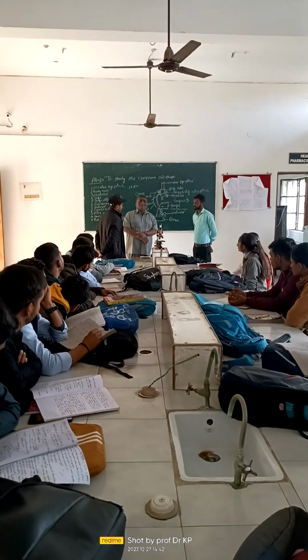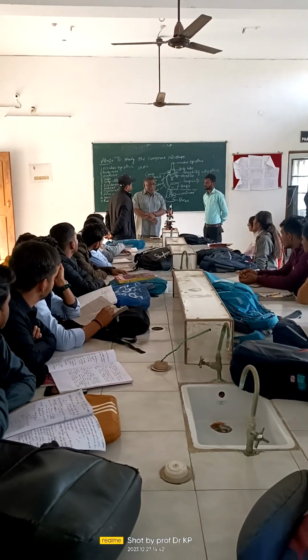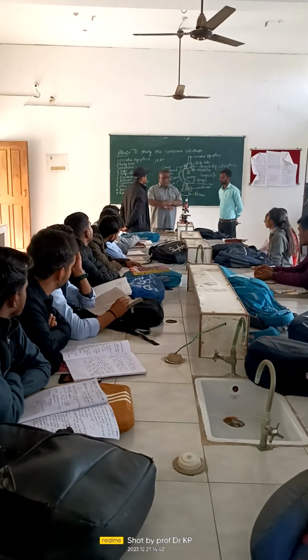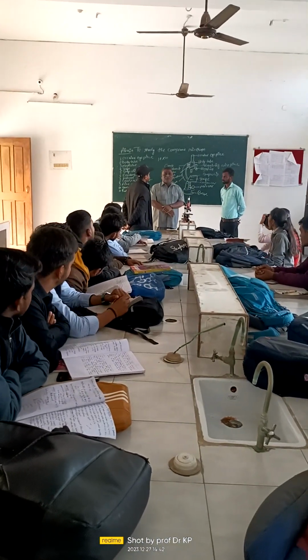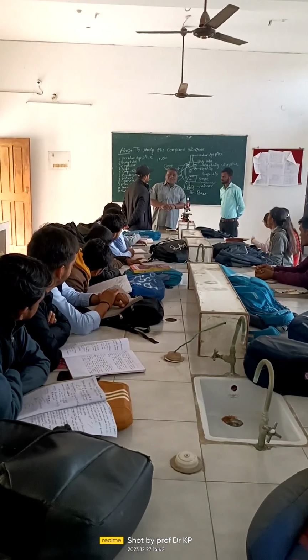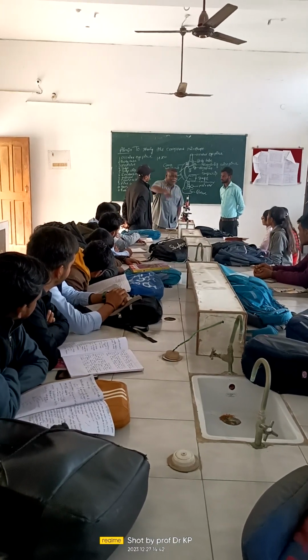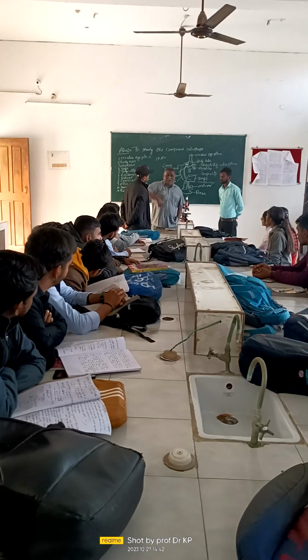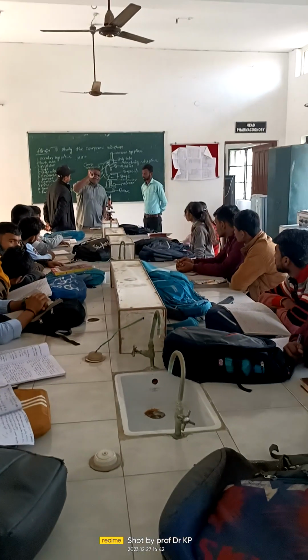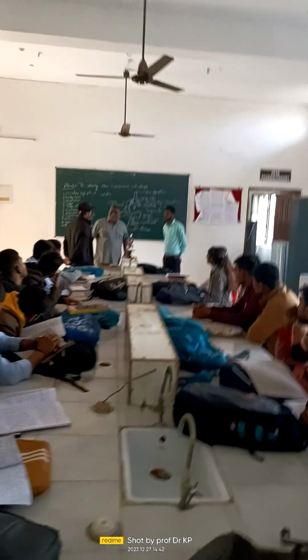It is very costly, maybe going up to crores. The price will be going up to lakhs and crores, so that will not be available in a normal educational institute. Only the bigger research institutes will have an electron microscope, in which a beam of electrons is passed through the material. The electron will be capable of interacting with every molecular structure of the material being viewed, so that even a small cell or a structure of the cell can be seen in magnified size. That is what I said, electron microscope.